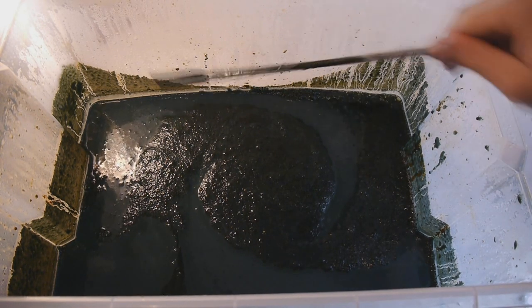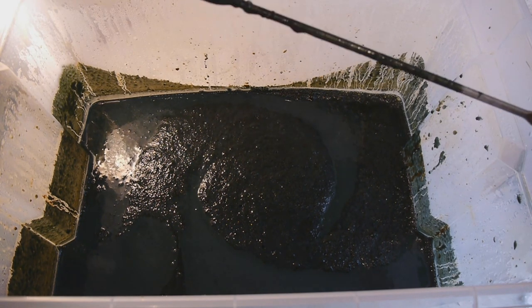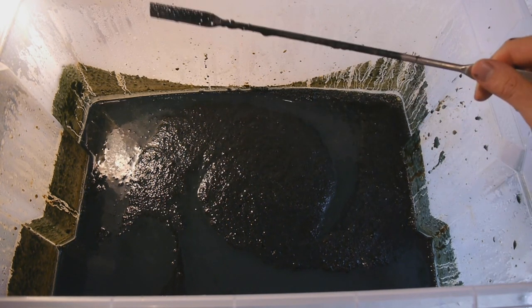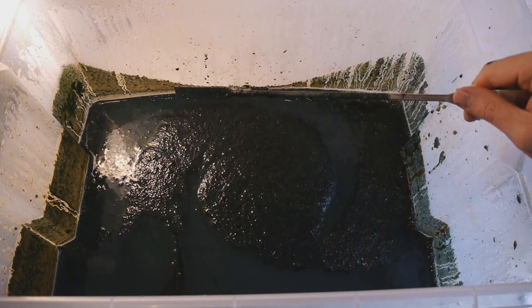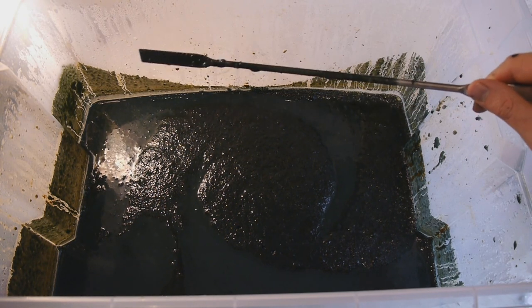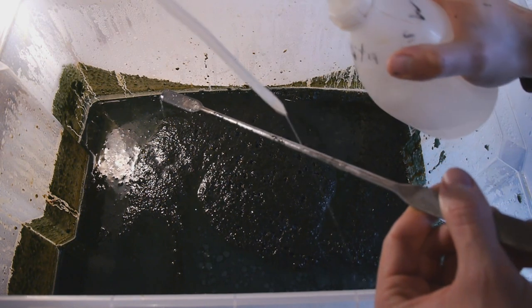Now we need to let this settle out a bit, then we drain off the excess water, and then we need to wait for all the rest of the water to evaporate, because this is way too voluminous for me to wash. I need to wait for this to dry out, so that I can wash it with a reasonable volume of water. I will just wash everything down with tap water.